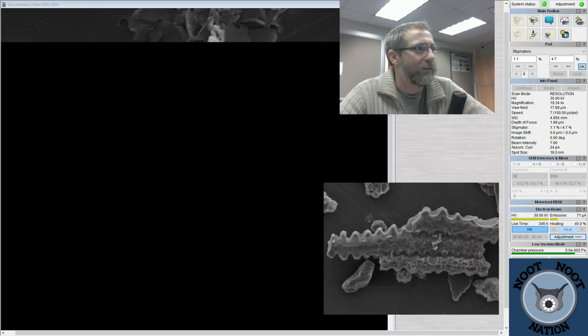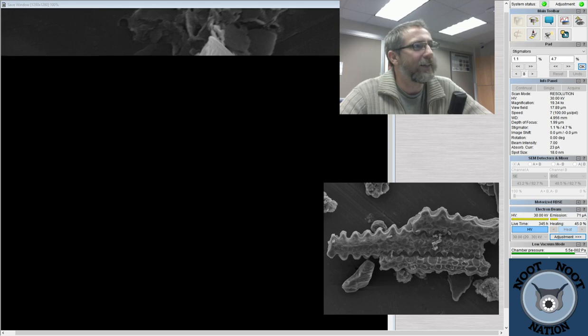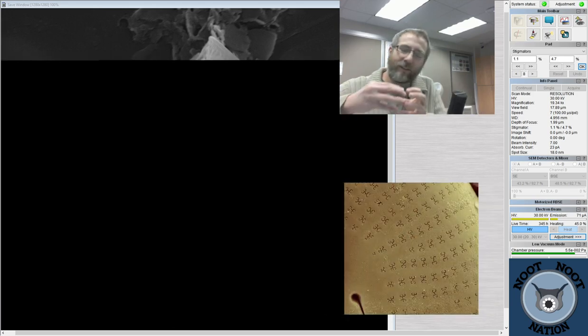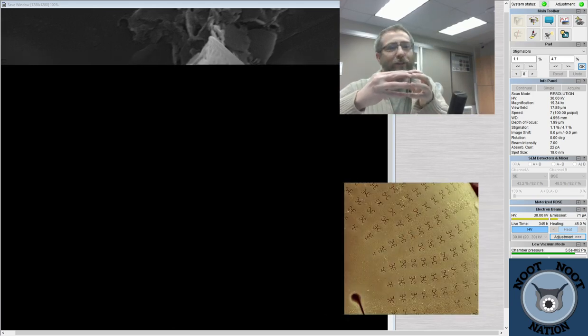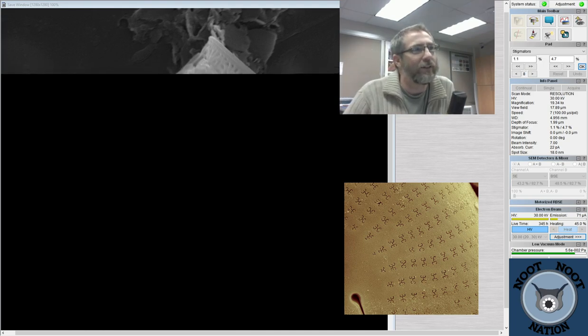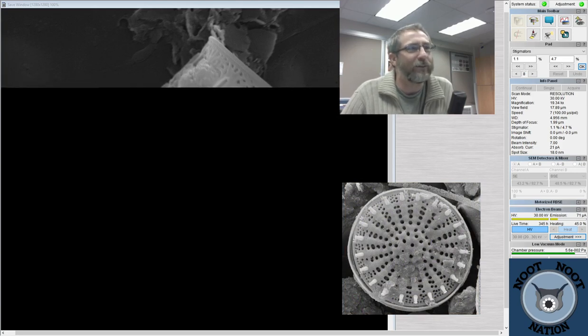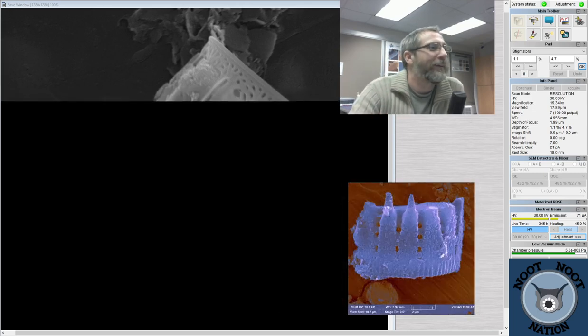Okay, and I can come back and see what's going on. Skeletonema. Yeah, it's like a cage, a little bit. It's like they're holding on the tips of their fingers. It's like they want to be close to their sibling, but they don't want to be too close to their siblings, you know? Like, I like you. I want to hold on to you permanently, but I don't want you next to me too close. Don't crowd me, right?